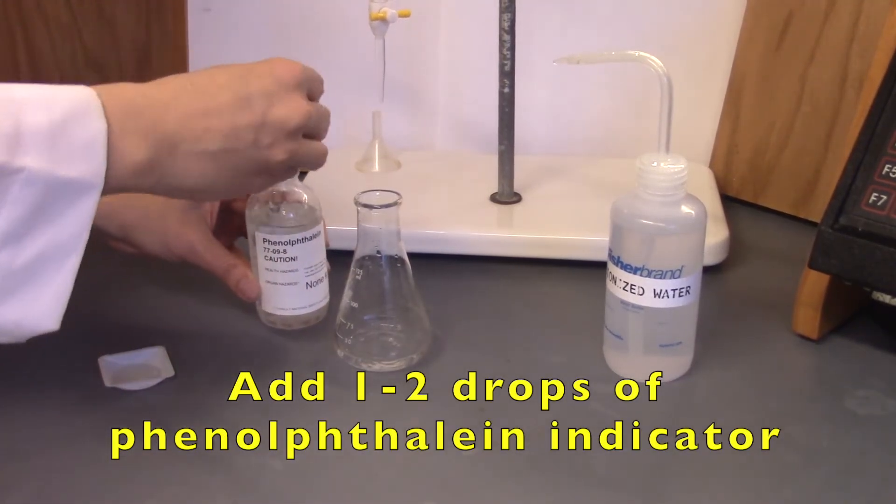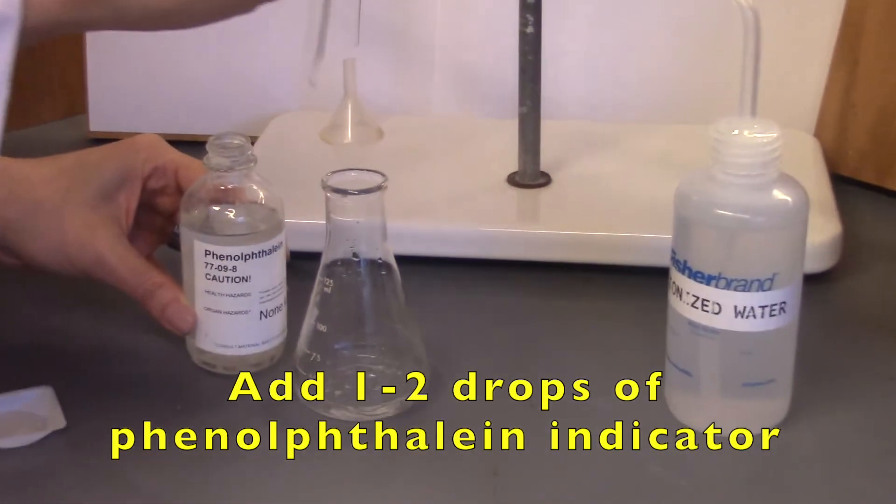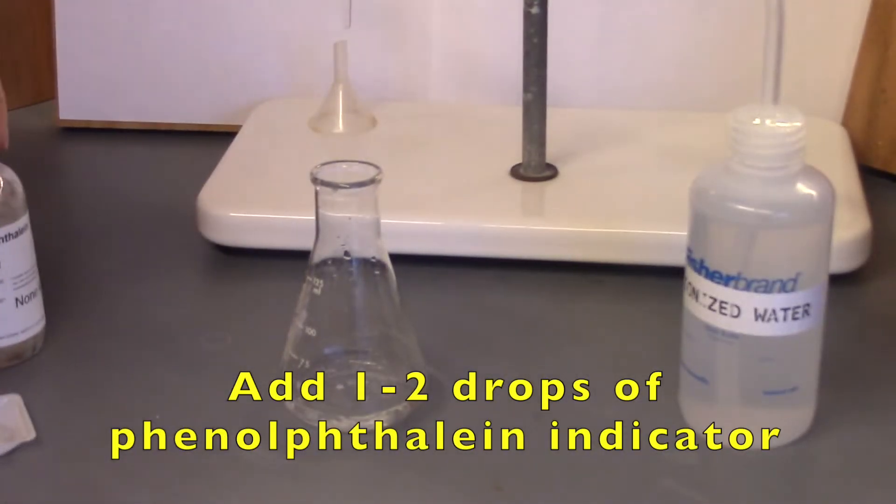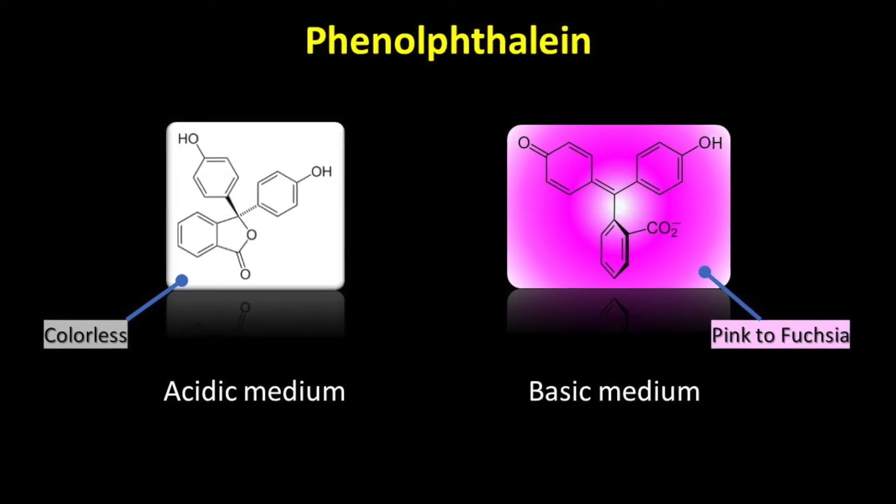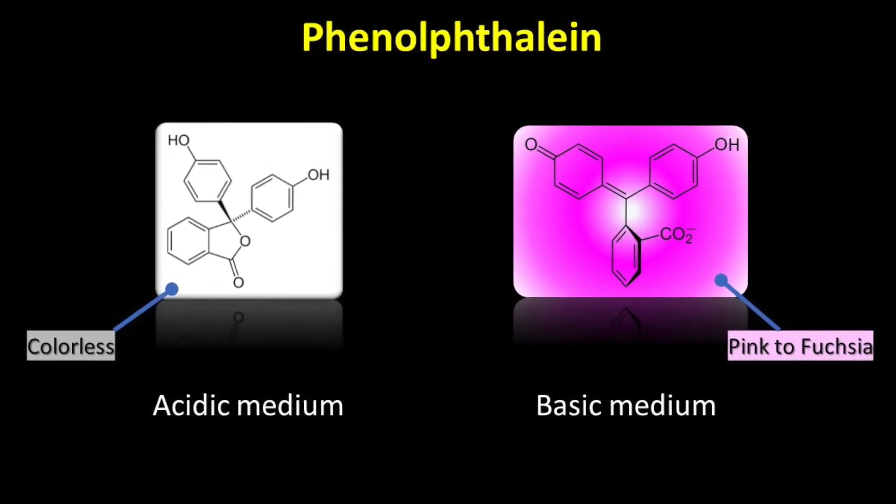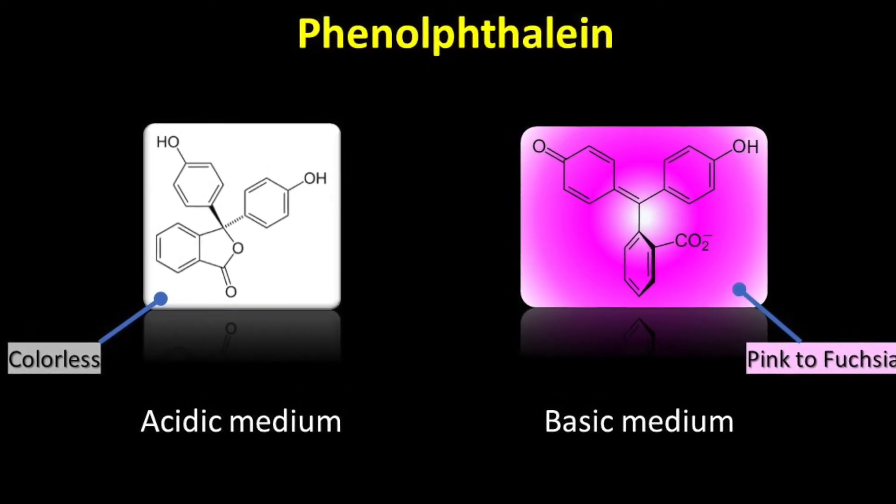Add 1-2 drops of phenolphthalein. Phenolphthalein is an indicator that is colorless in acidic medium. Under basic conditions, the indicator becomes pink due to a change in structure that results in an extended conjugation.